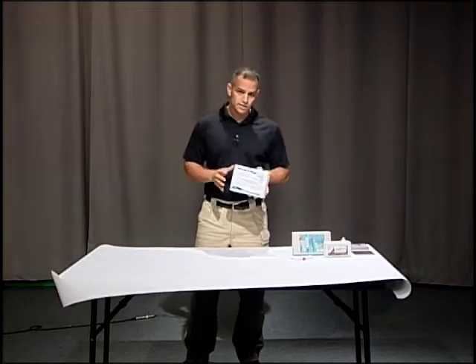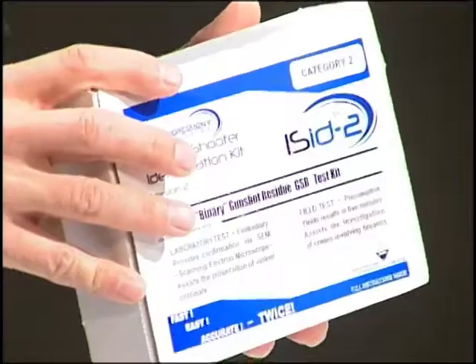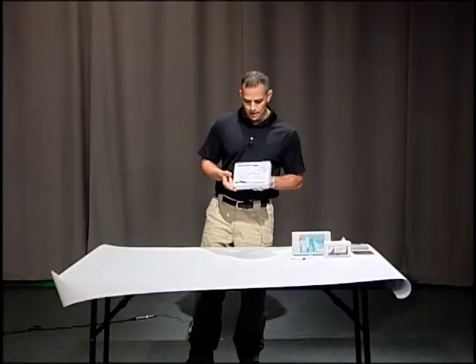Depending on what state you're from will depend on what category you use — there's category 1 and category 2. I'm filming this in New Hampshire, so we're using a category 2 kit. Let's open the kit and see what we have inside.